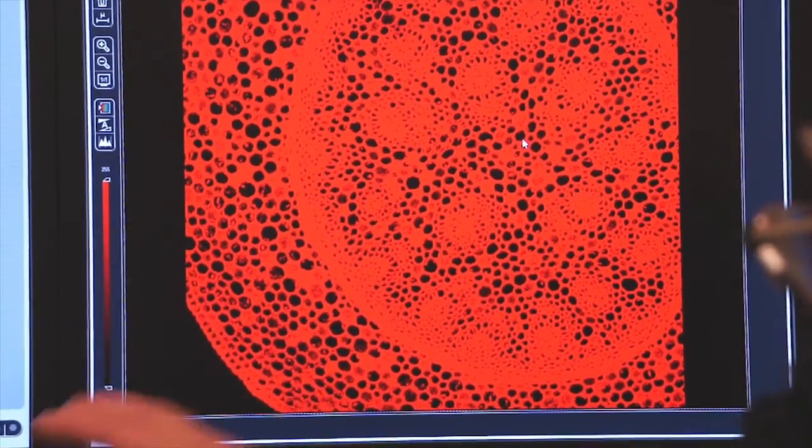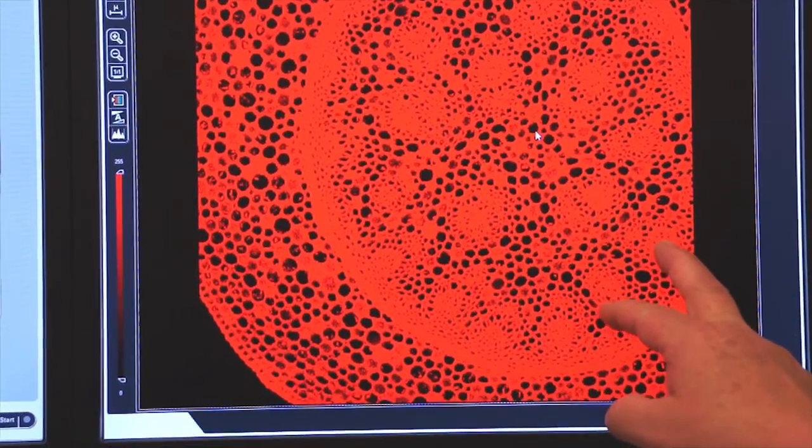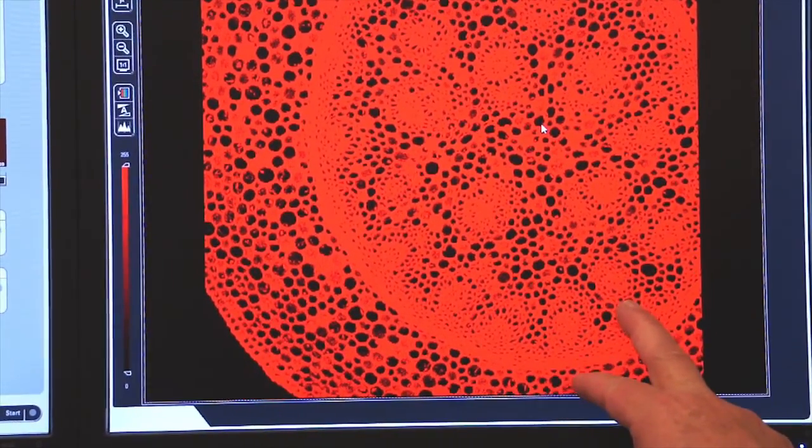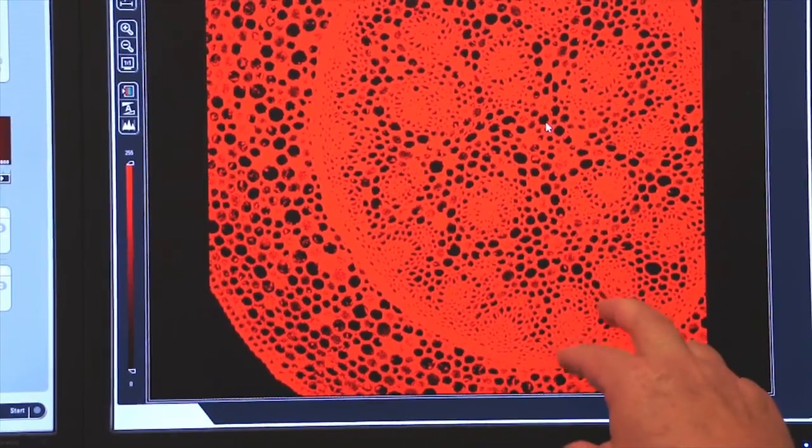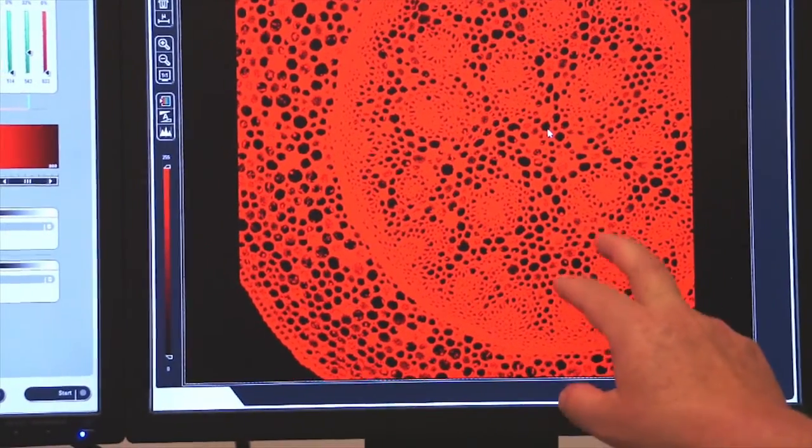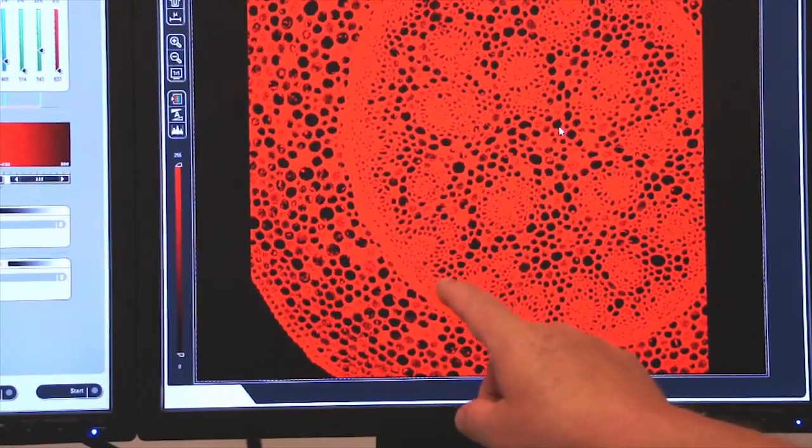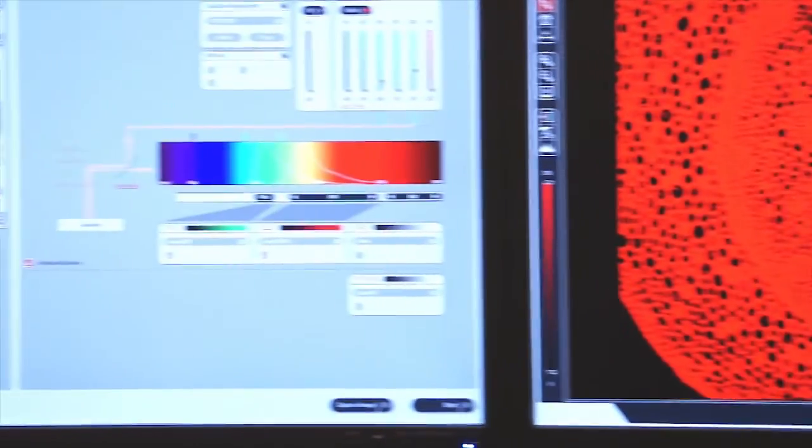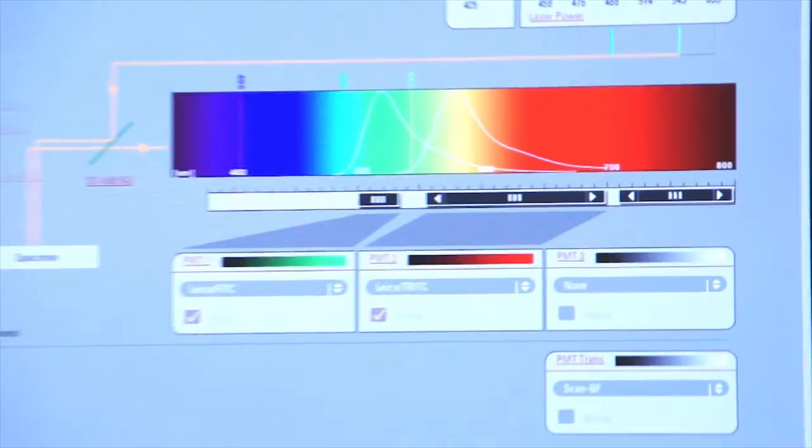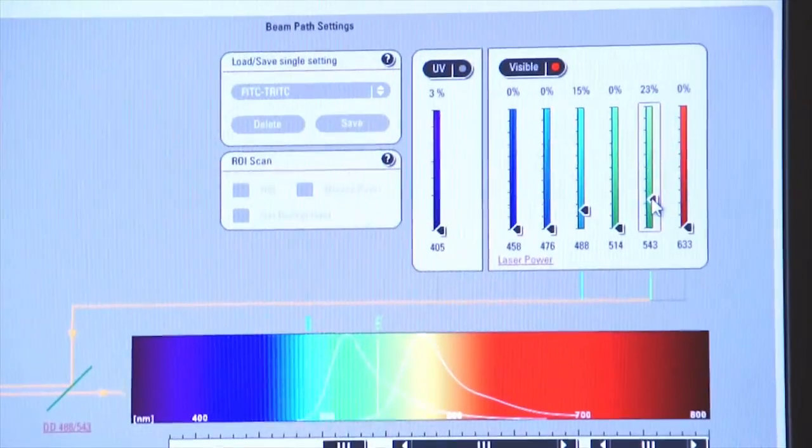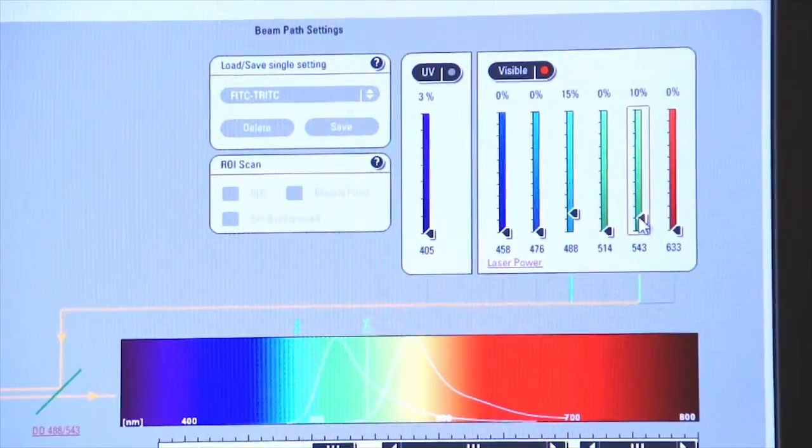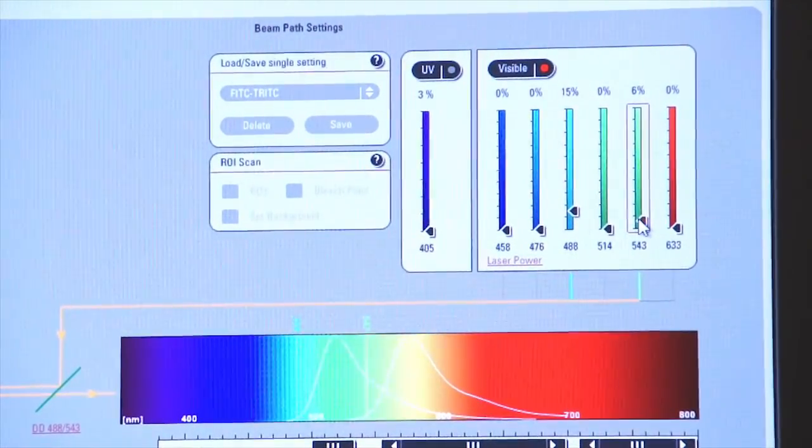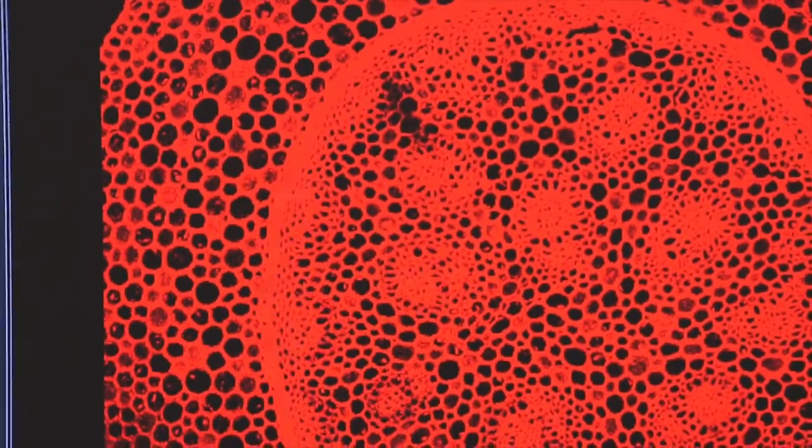And if we look at the right screen, we'll see that the image is a little bit washed out. It's a little bright. Since I'm at 900 volts on my smart gain, this tells me that my laser power can be lowered. And so if we go over to the left screen, we can lower the power of the 543 laser by diminishing the power applied to the laser. You can see that this now returns a better image that's not as washed out as before.